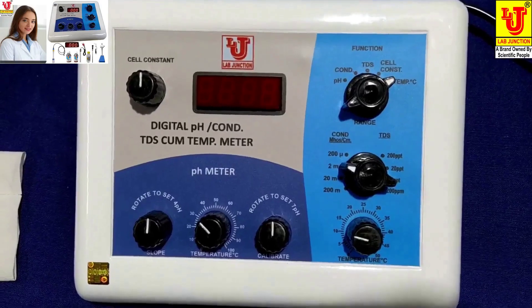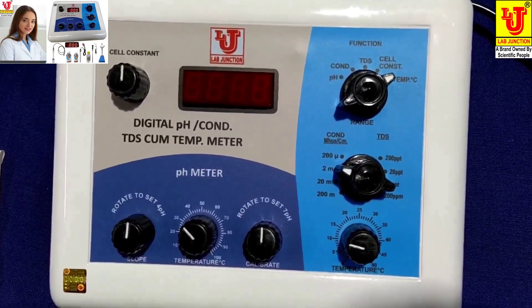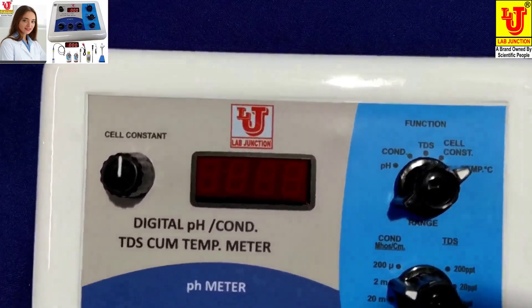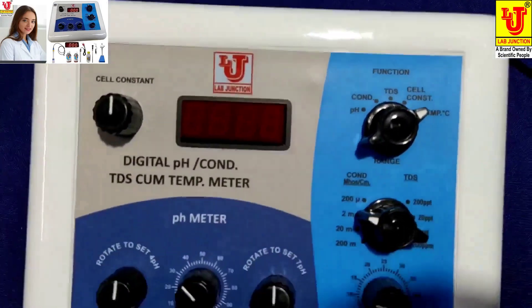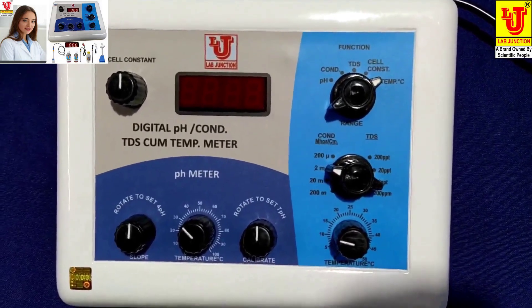Lab Junctions Digital pH, Conductivity, TDS, Temperature Meter. We have two models.